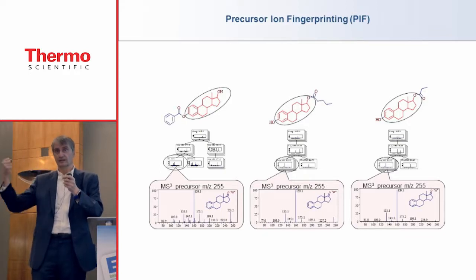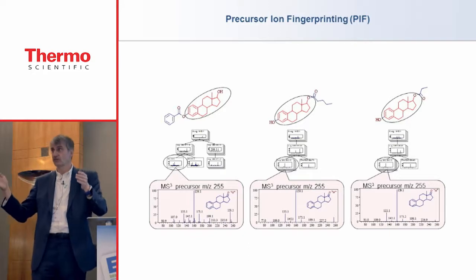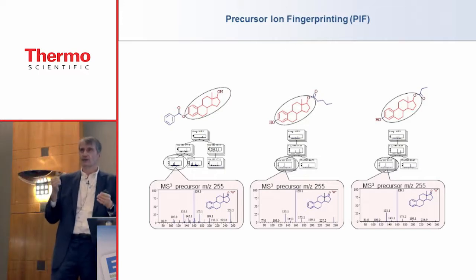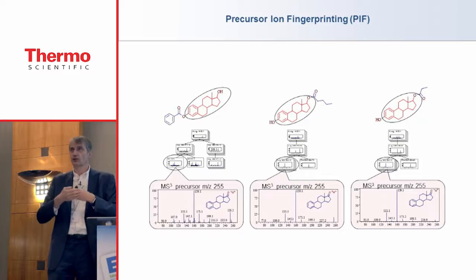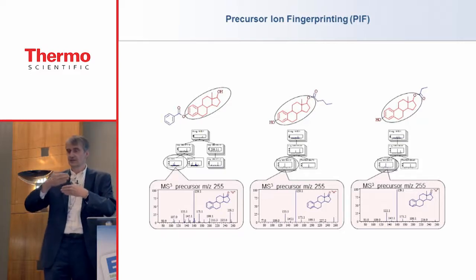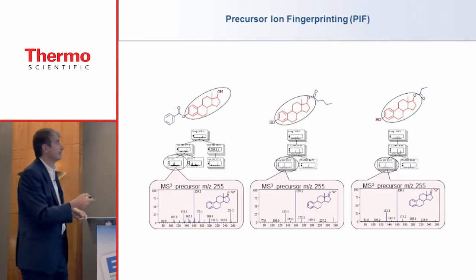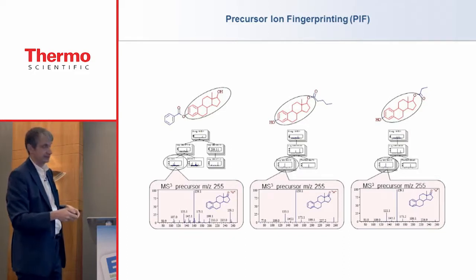So once we isolate a fragment and do an MSn spectrum, we will always get the same spectrum. Not the same, so I would rather say matching spectrum. The only thing the ion remembers is its internal energy. And we can compensate for these internal energies by spectra acquired at various collision energies. So if this one were unknown, and those were in a database, we could at least identify the substructures based on these spectra.